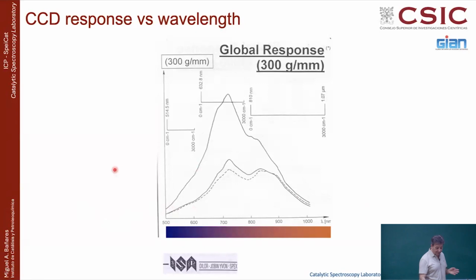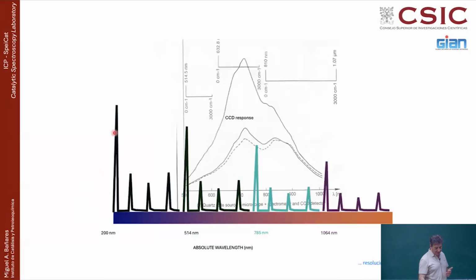Now, the other thing is that you remember that for a given laser, you get the peaks. For instance, at this laser, you get this peak, at this laser, you get these peaks, at this laser, you get this peak, and in this laser, you get these peaks. So it's basically like a green laser, you get these peaks here. So the system is becoming increasingly sensitive when reading your peaks. With this laser, you get your peaks there, and the system will even get a better response in the middle peaks for a spectrum that goes from 0 to 3000 Raman shift, and 3000 is like carbon-hydrogen already.